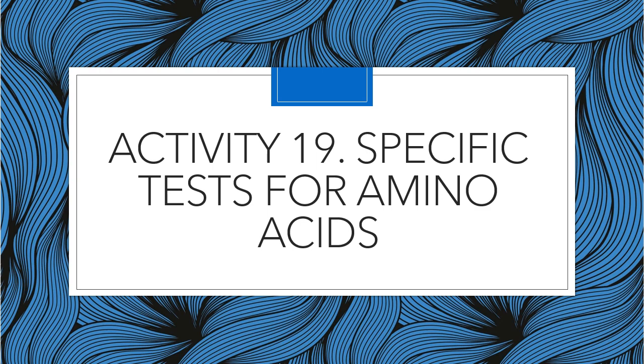Okay, so let's take a look at Activity 19, your specific tests for your amino acids. We already did your tests for the properties of proteins, and the general tests for proteins. Now we're going to move on to your specific tests for amino acids. As we said previously, amino acids are the building blocks of proteins, meaning when you hydrolyze, or break down, your proteins, it will give you your amino acids.